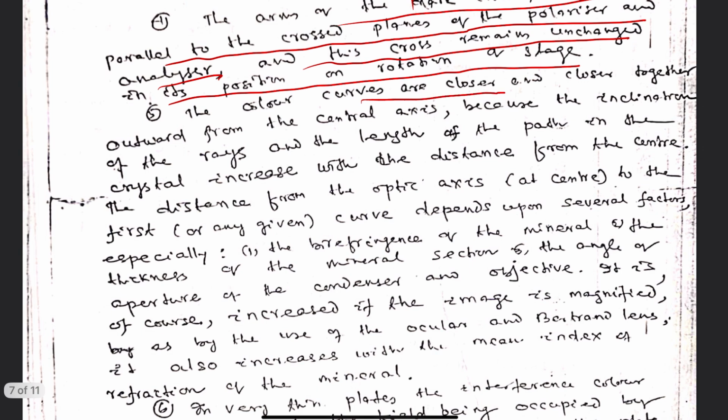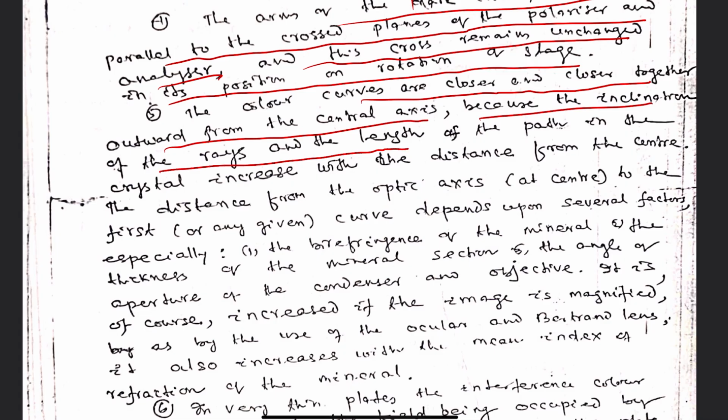The color curves are closer and closer together outward from the central axis, because the inclination of the light rays and the length of the path in the crystal increases with the distance from the center.